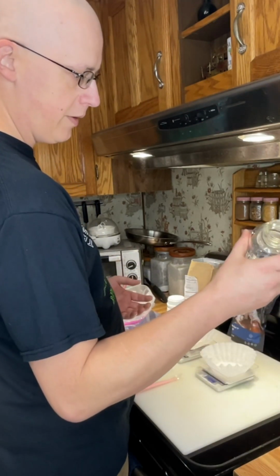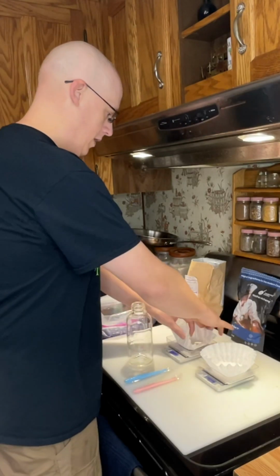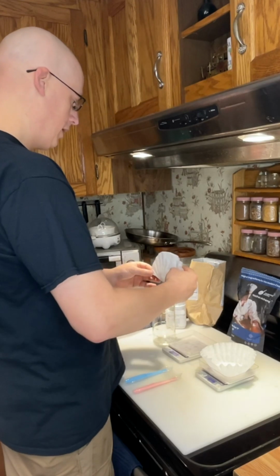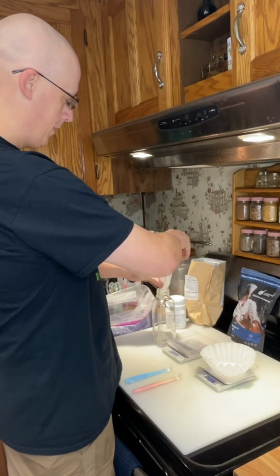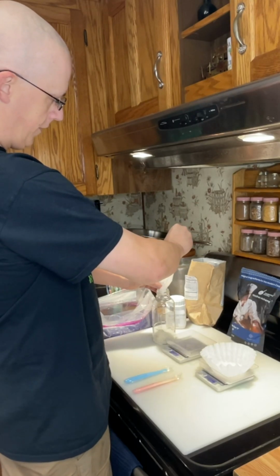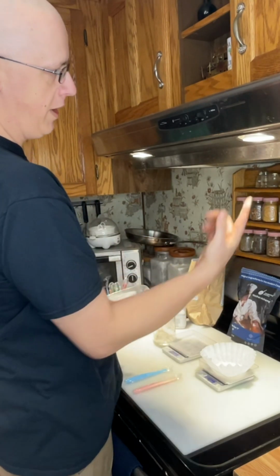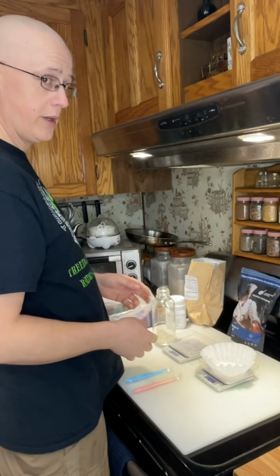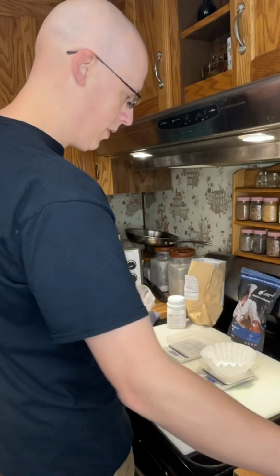I'm pouring into a dry bottle here. If you had a wet bottle, you'd want to add water right away because the agar will kind of lump up on you. Anyway, I kind of use the coffee filter like a funnel here. Normally I'd have this hood fan on. It would suck up all the dust. It's a really good idea. I'll set that one aside.